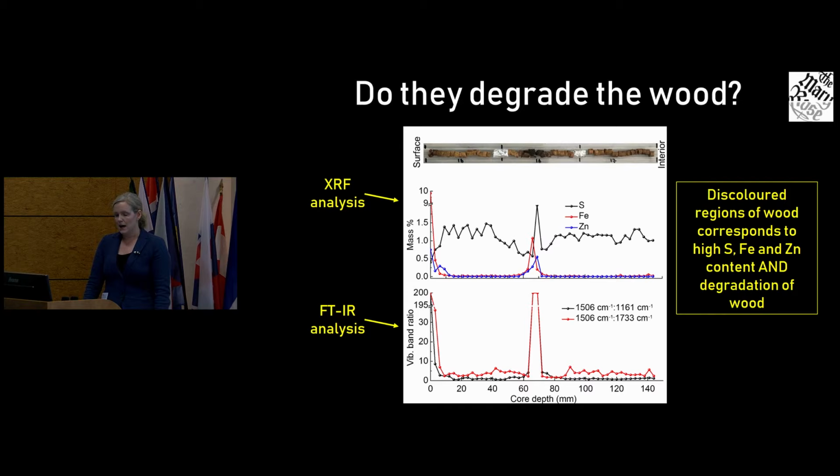We talked yesterday about how it's very important to do your characterization before you come to the beamline, but the reverse is also true. What we've learned at the beamline, we can then take back to the lab and think, well, how can we further our understanding with that? This is one of the same core samples that we ran all these experiments on, but here we wanted to look at just benchtop XRF and also FTIR.